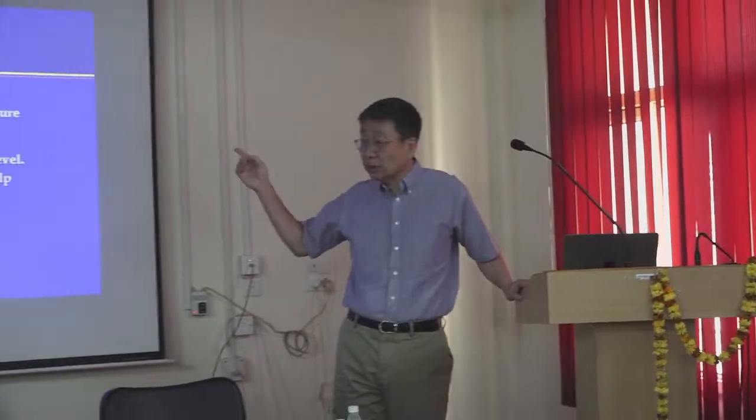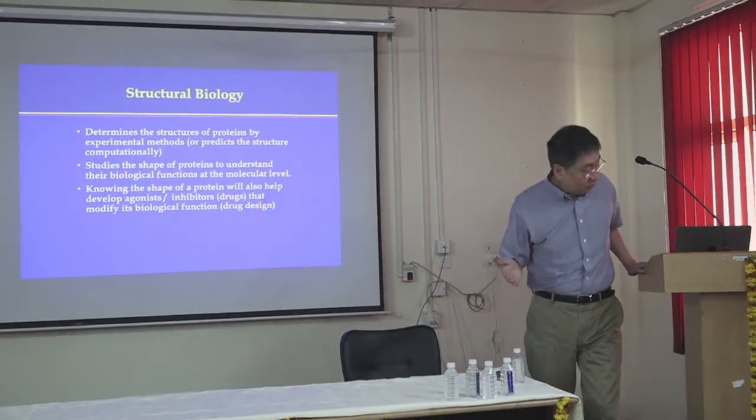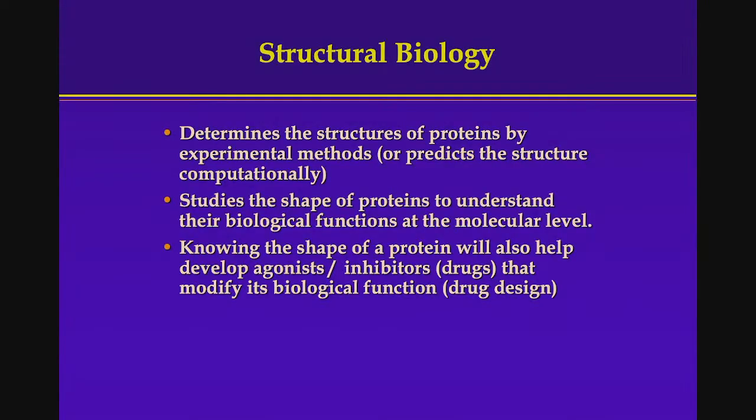So let's start. I have a lot of slides. We'll just go through them and stop me with questions. So structural biology, the basic idea is to use structure to understand function. So the first step, of course, is to determine the structure by experimental, I forgot to ask for a laser pointer. Do we have it? That's your pointer. So, I don't have a mic.